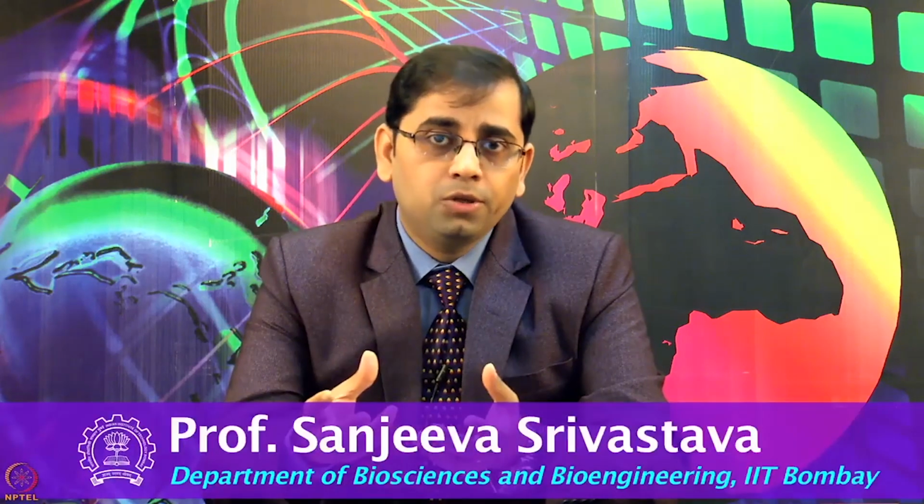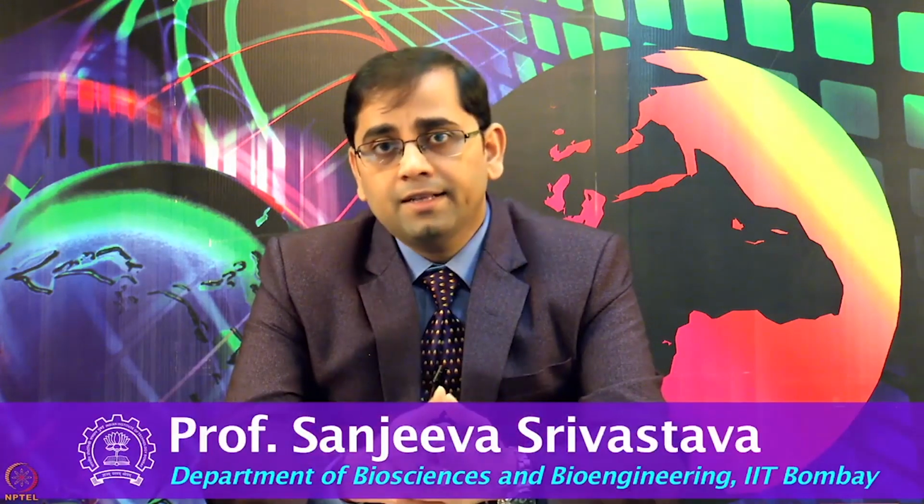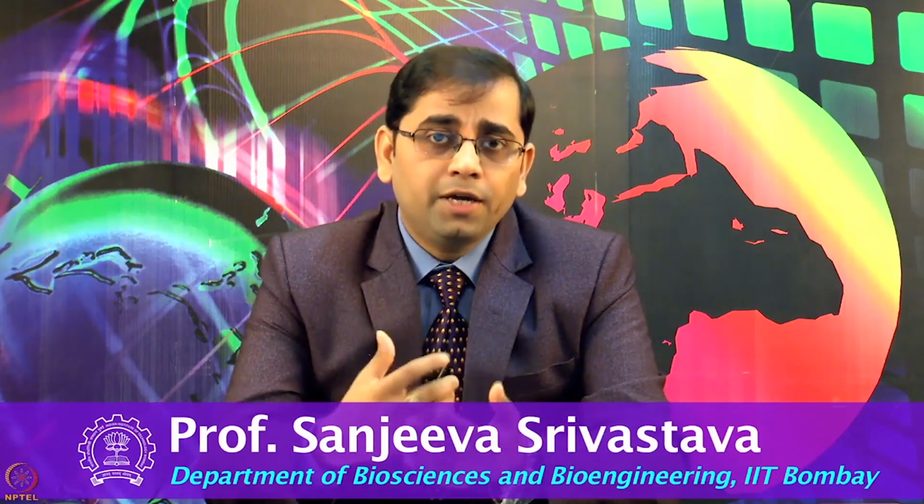In the next class, you will see another application of protein microarrays where we will shift the gears to cancer research and also the platforms. So far we have talked about cell-free expression based protein microarray platform. We will now talk about how to take purified proteins printed on the chip using human proteome arrays and then apply those to investigate a deadly disease, cancer, and talk to you about both experimental demonstrations as well as the theoretical concepts involved in performing such biological experiments.